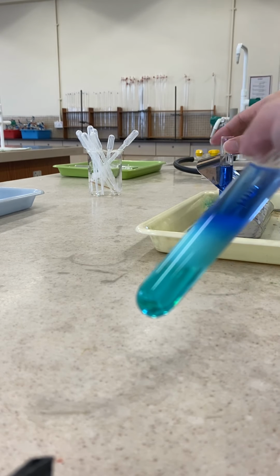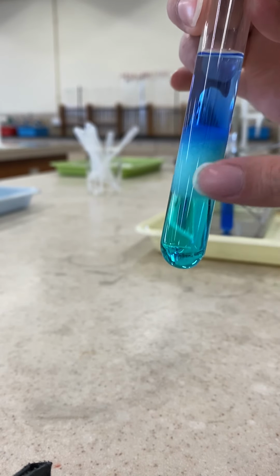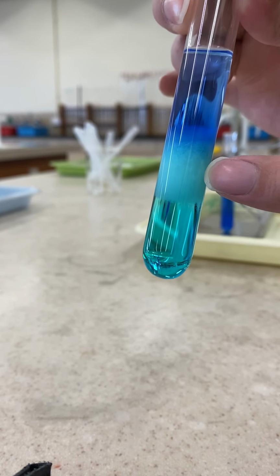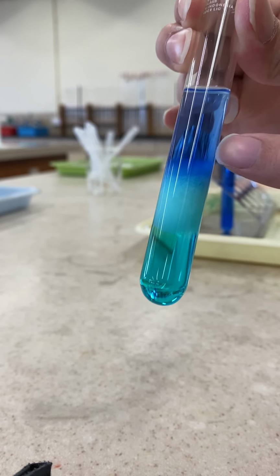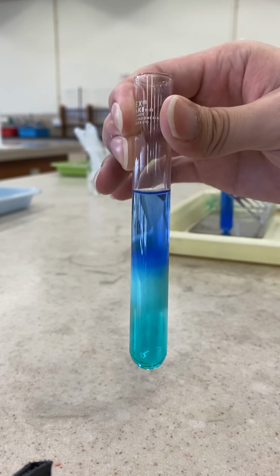But this time, because I didn't shake it, it is in layers. Originally the color was a clear blue solution, and then some pale blue precipitate forms, and on the top of it, because of the contact with the ammonia, it can further react to form this deep blue solution. So that's it.